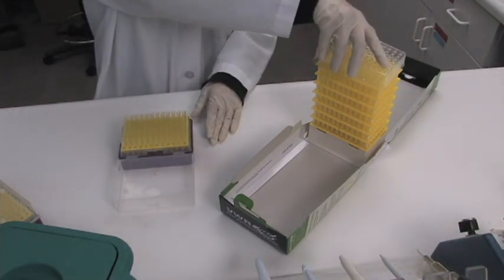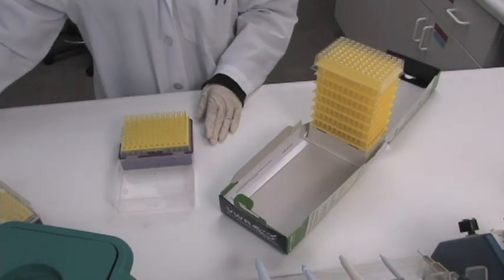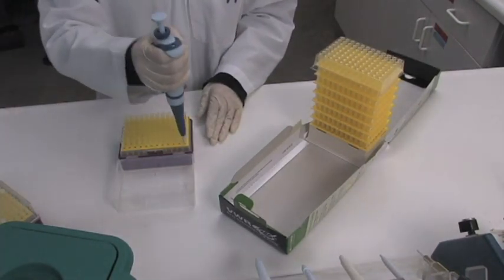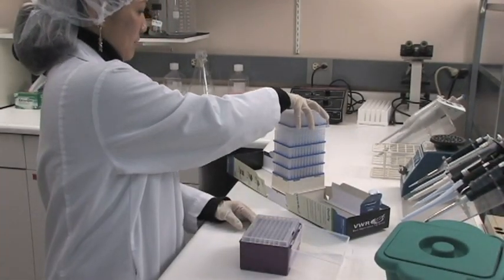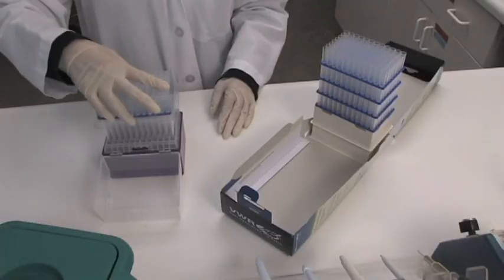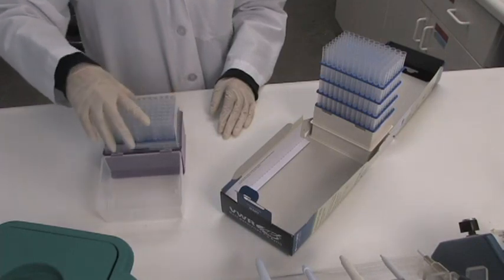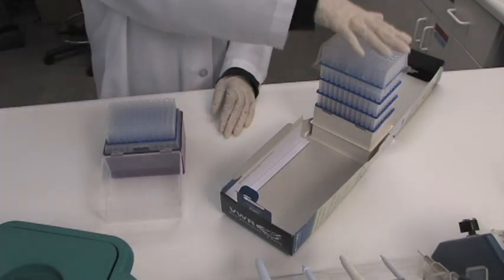Next generation refills lock into place so even multi-channel pipettes work well. The clean and compact next generation is available filled with tips that work on all ranges and styles of pipette.